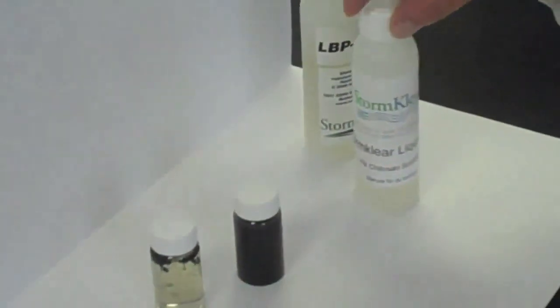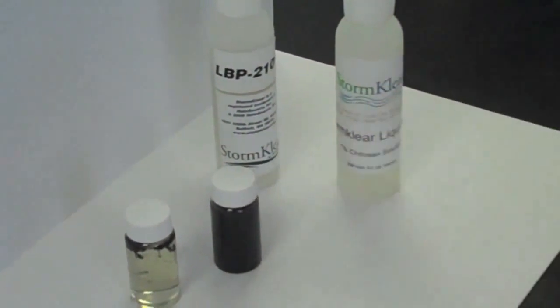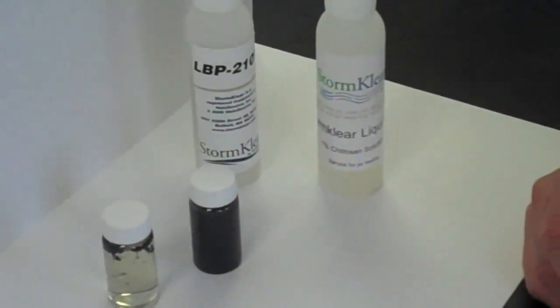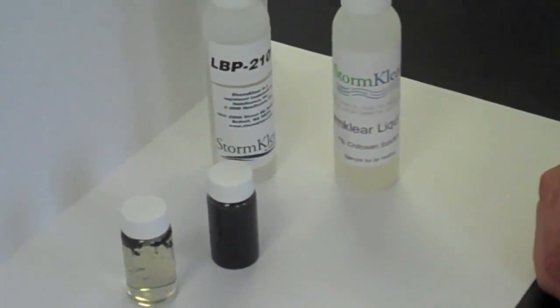As you can see, it would be very difficult to separate that from this water, but with the use of our dual polymer system, it's very effective in taking that oil out of the water.